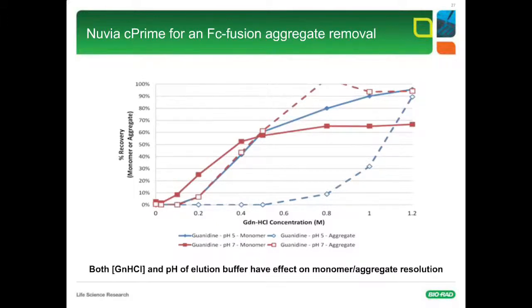Now, besides taking care of the impurities, we also want to have a good recovery of the target protein and maintain its activity.